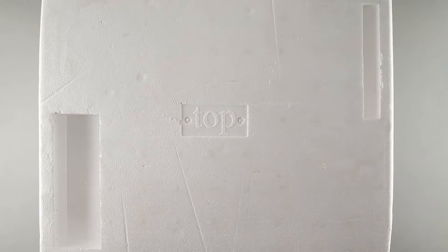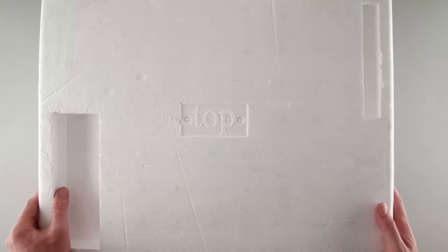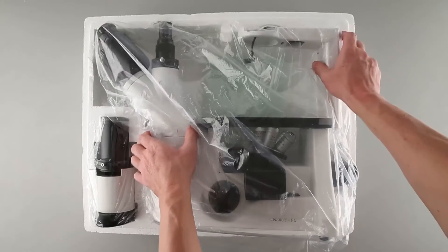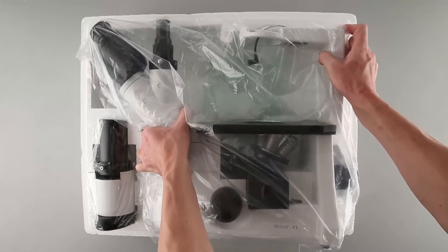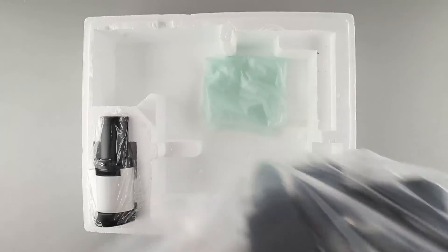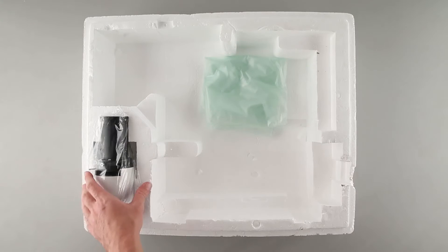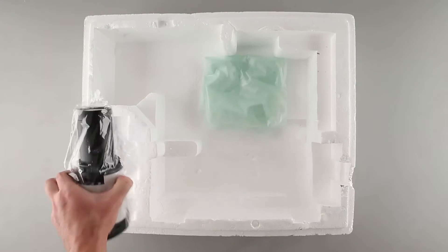When unpacking the components, always look for an arrow or a word which designates the top. We'll start by unpacking the body. Now we'll unpack the top transmitted lighting module.